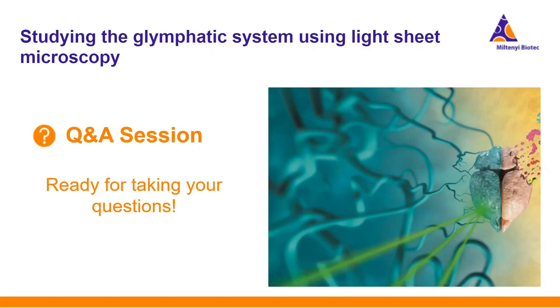Okay, that is a good question. We haven't tried to switch the order, so of course that could be tried, but I believe it makes more sense to do the decolorization step first, because I think this is more water soluble. Then if you are using the DISCO protocols as we are, you are later dehydrating the tissue. After that, you don't want to reintroduce water molecules, because then you have solvents, but not actually water.